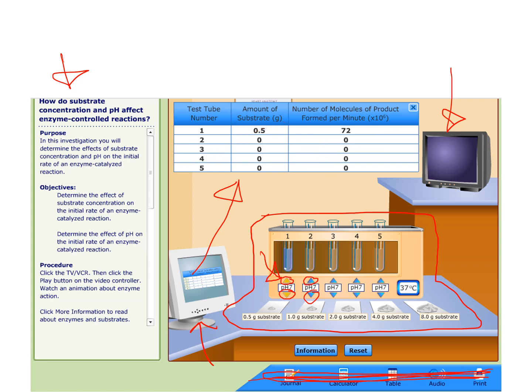I've included here one little example of part of an experiment. What I did was, so I'm going to look at this, and then I'm also going to look at this here. So test tube number one, that's here, labeled number one. The amount of substrate added here, and remember they include grams, the units at the top or the heading of the column, as opposed to putting grams here, writing it all over and over and over again. That is bad form in science. So amount of substrate added, 0.5 grams. You added that. Well, actually I did. And where did I get it? I got it right here.